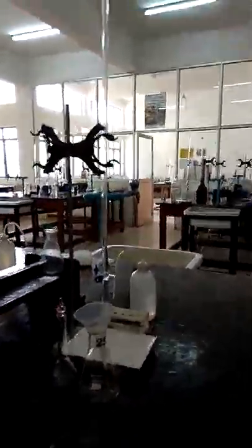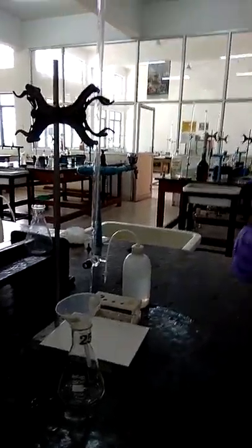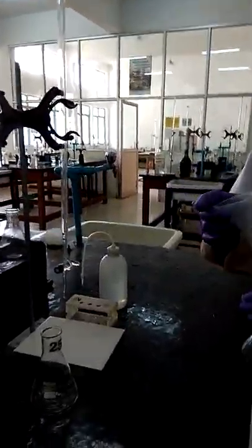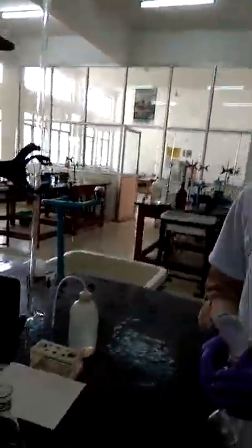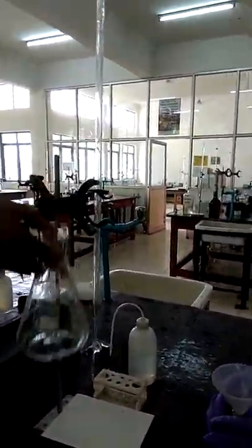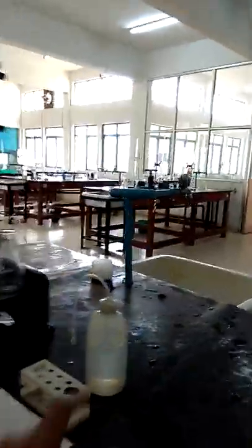Okay, good morning everyone. We are going to show the demonstration for the total hardness experiment. First thing is you need to clean all the glassware three times with distilled water. So this is the burette, and this is the conical flask. And this is the standard volumetric flask used to prepare standard EDTA solution, and this is the funnel. And we have the wash bottle here.